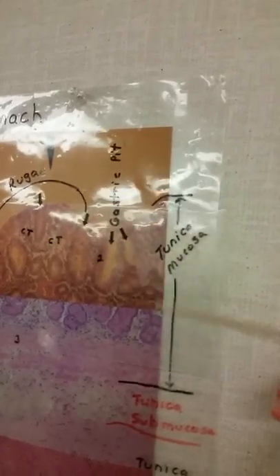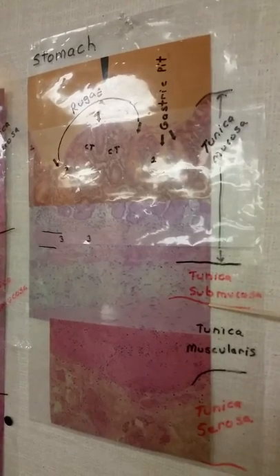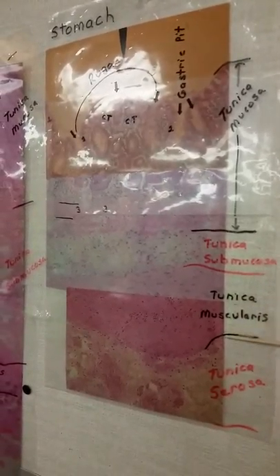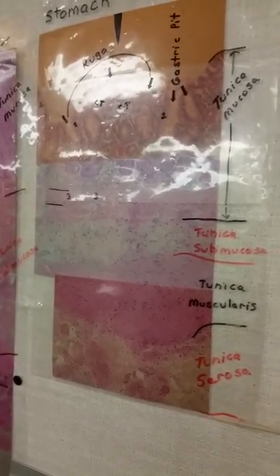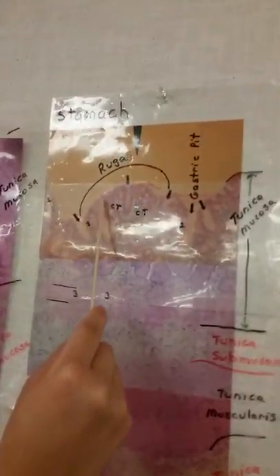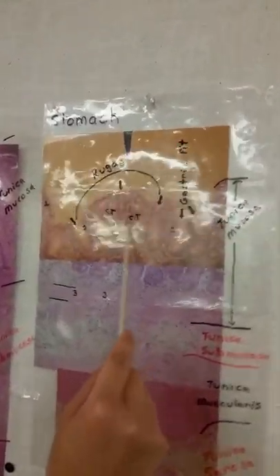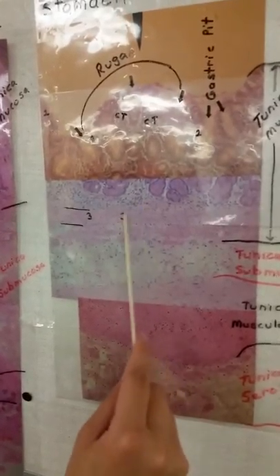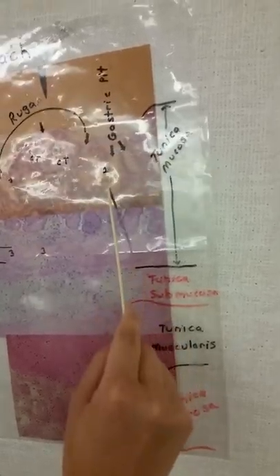Moving on to the stomach, we have the tunica mucosa layer here. And then to the tunica submucosa, then to the tunica muscularis here, and the tunica serosa. And then this is a simple columnar epithelial tissue, non-ciliated. This is connective tissue. This is the muscularis mucosa. This is the gastric pit for these here.